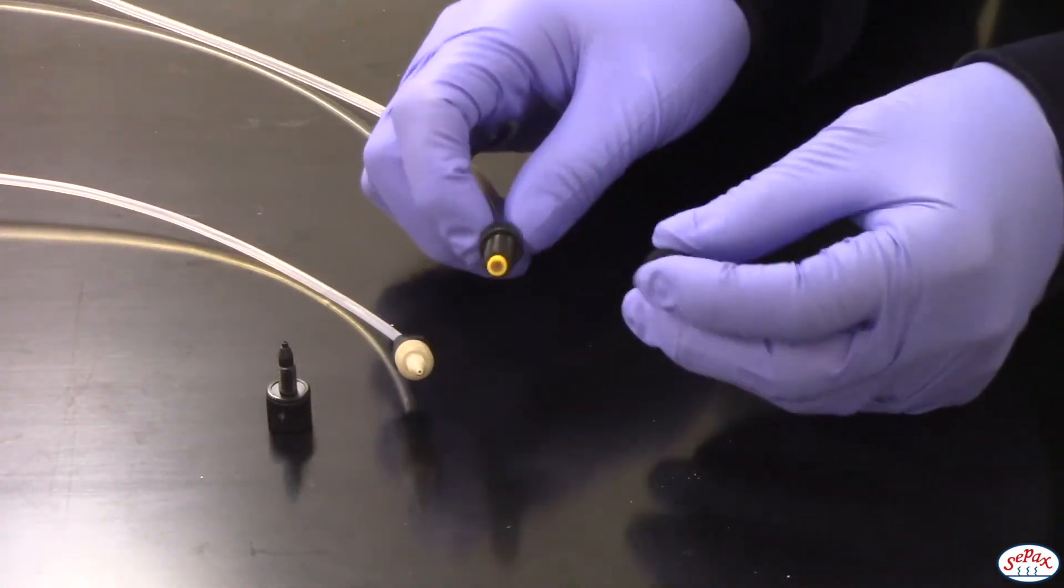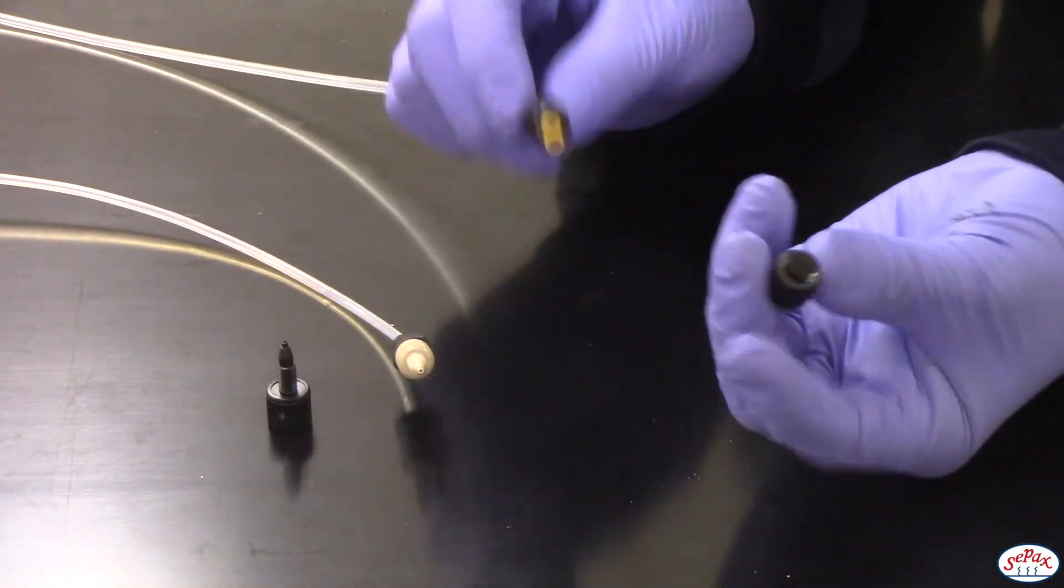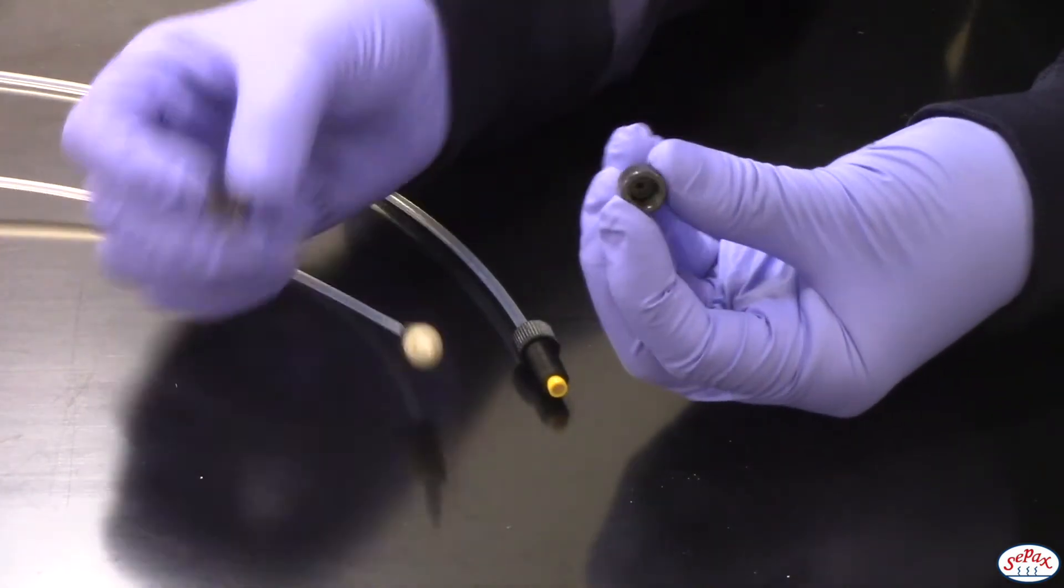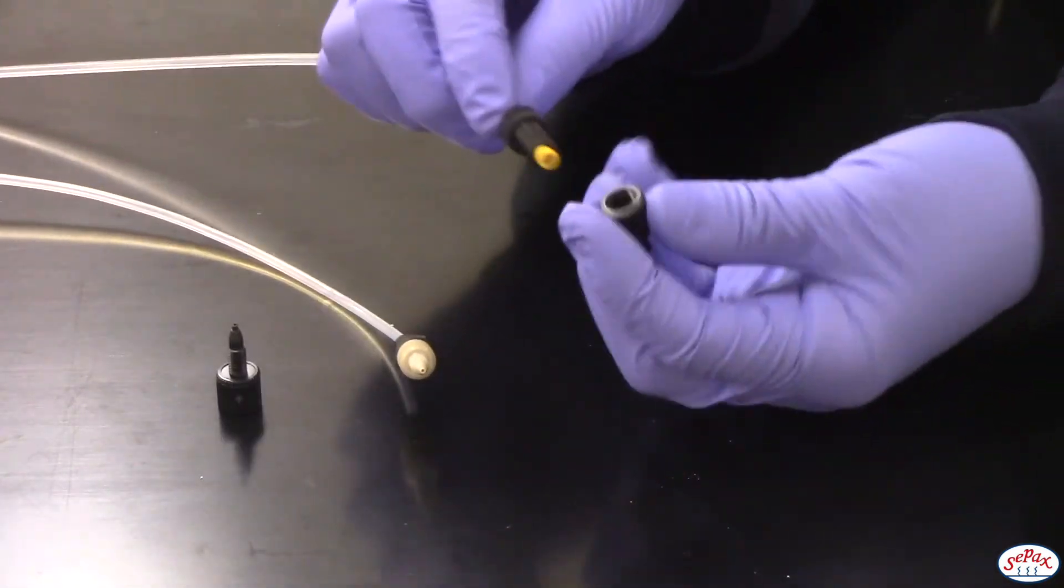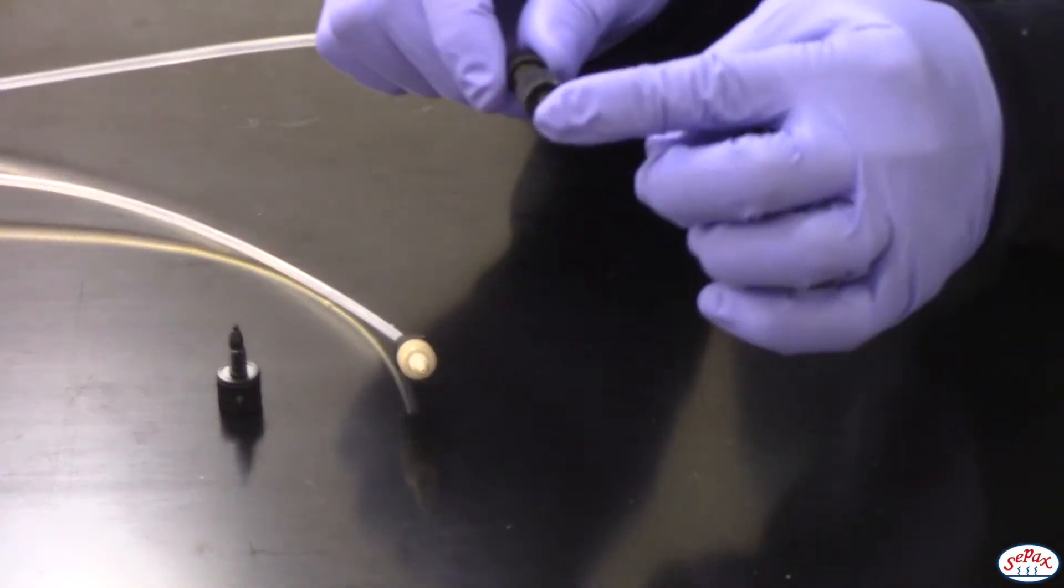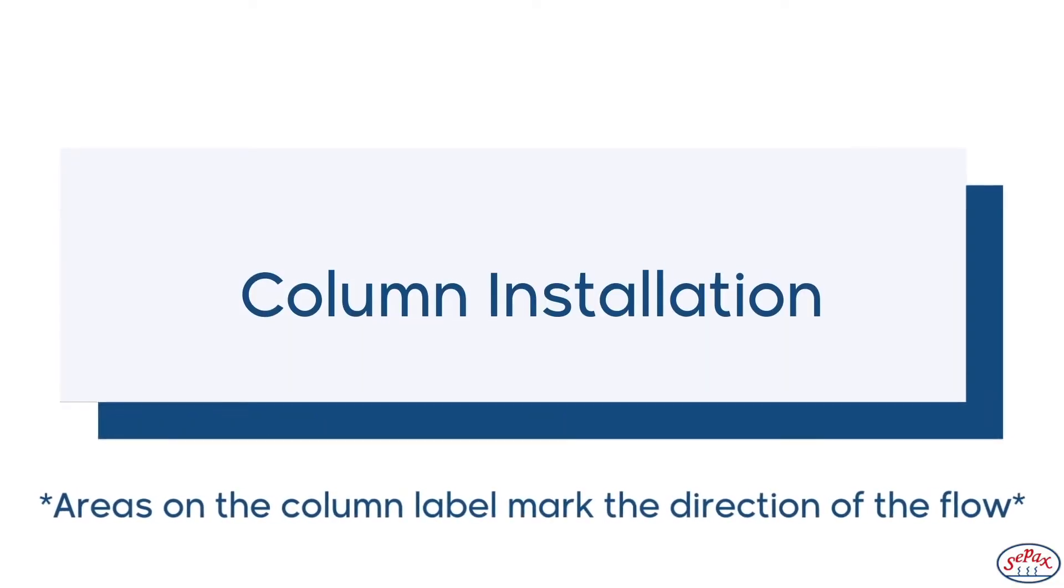The 5/16th connector on the 1/8 outer diameter tubing would screw into this union, which as you can see is larger than this one. And this is a 5/16th female to 1/16th male unit. And then you are ready to screw this onto your column.